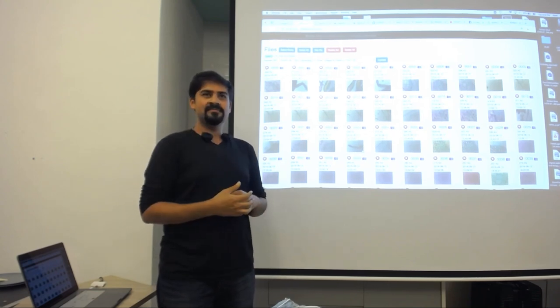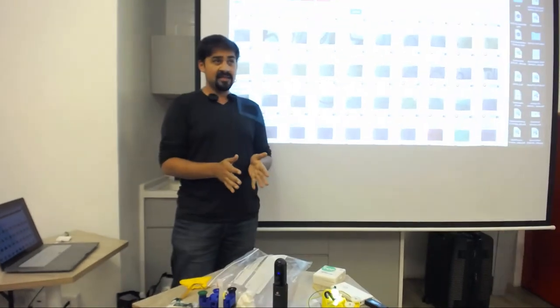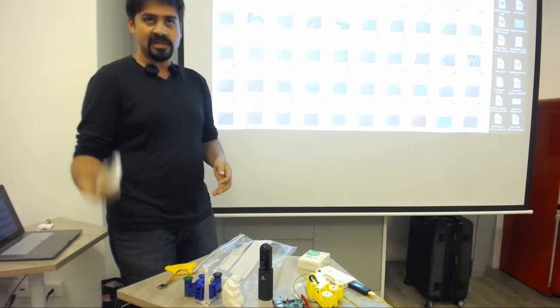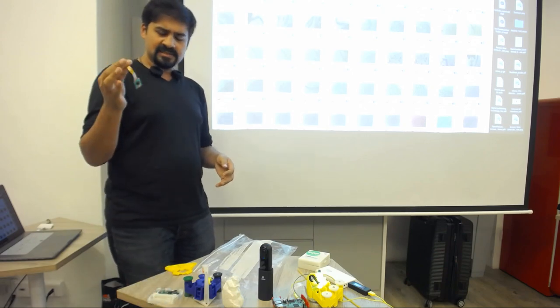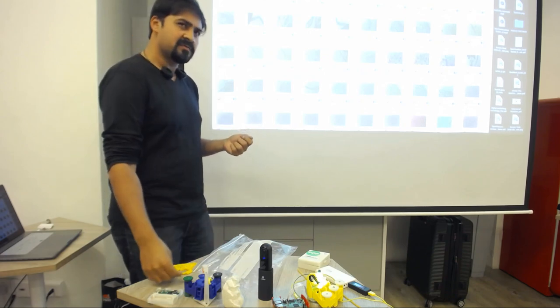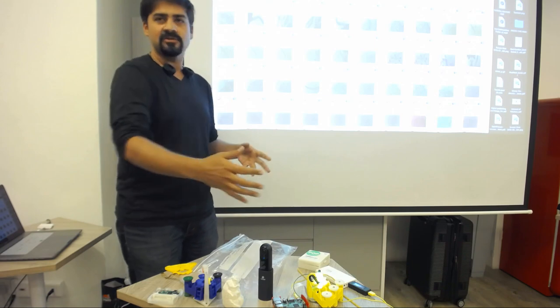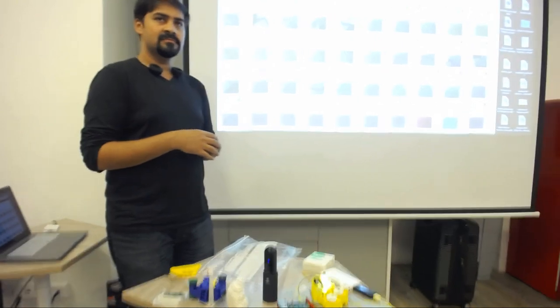Can it be made cheaper? Yes, I think so. I think it has to do with the camera. The camera is quite expensive, but for the Raspberry Pi, you can drop down to a Pi Zero and it will still work. If you replace this with maybe a USB webcam, you might be able to reduce it even further. But it's just the Pi and 100 grams worth of 3D print. Pi and the camera, sorry. But for developing countries, that costs more than $40 or $50. That's too expensive.